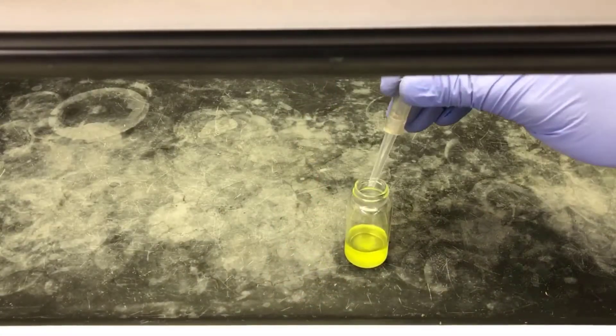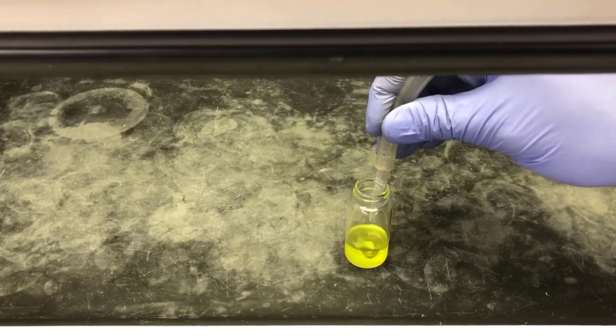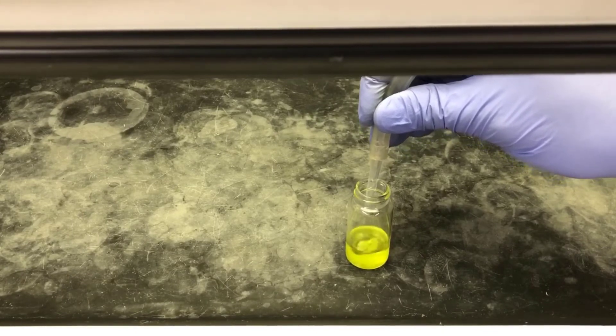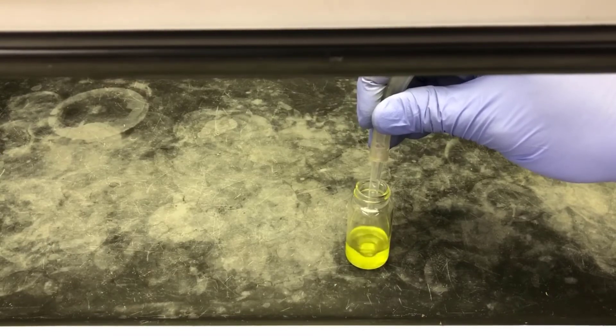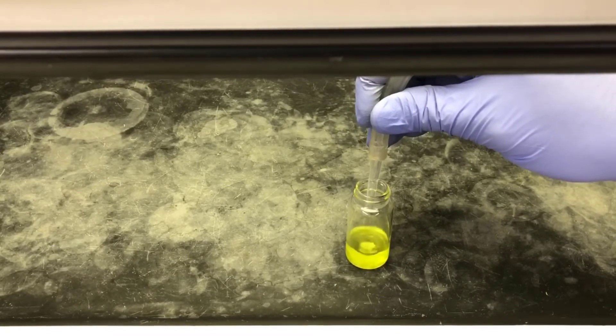In the next step, I'll remove the hexane solvent to isolate citrus oil. I'm doing this step in the fume hood to minimize exposure to vapors. Here I've got a gentle stream of compressed air that I'm blowing inside the vial to evaporate the hexane.